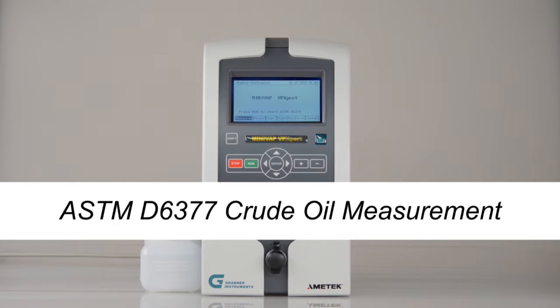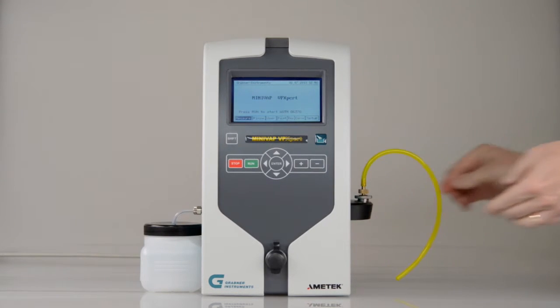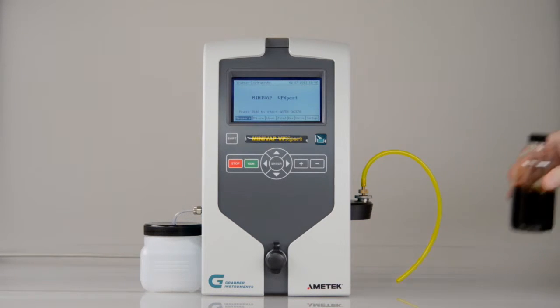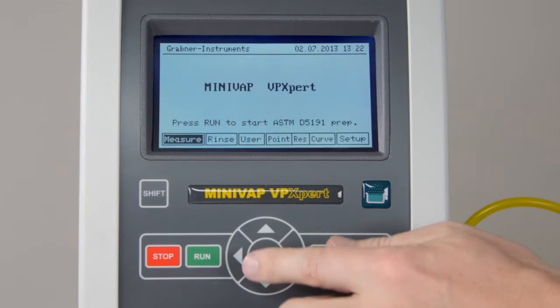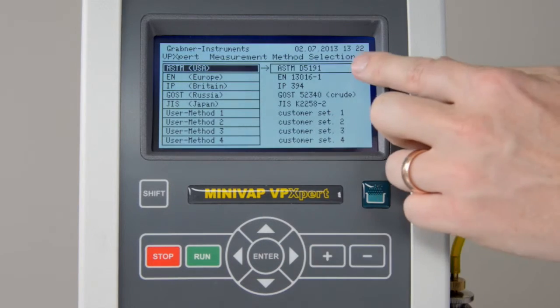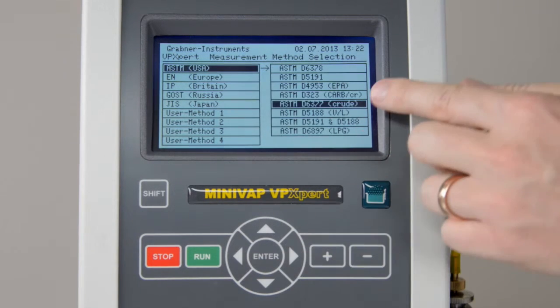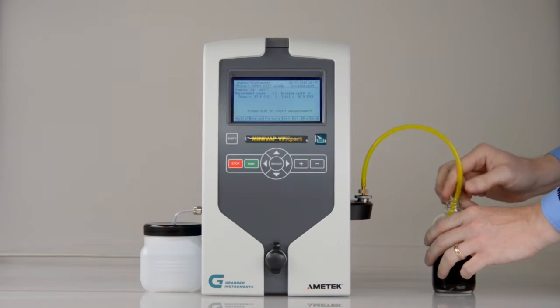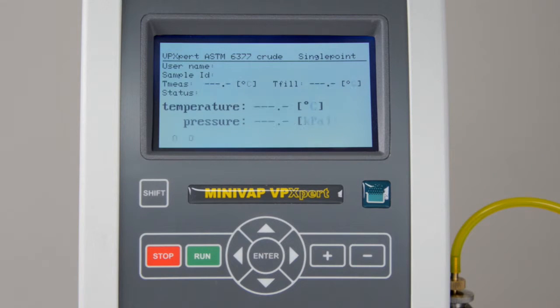ASTM D6377 crude oil measurement. Non-pressurized crude oil. To reduce equilibrium time for crude oils, a shaker is installed in every unit. For non-pressurized crude oil, select D6377 standard. Enter the sample ID, put the tube into the sample, and press Run to start a test.